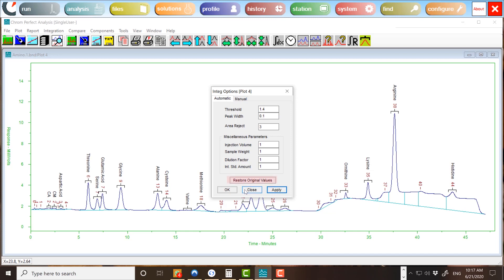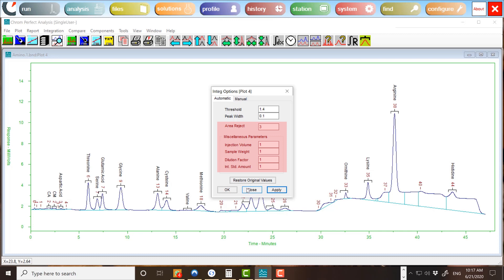Pressing the Restore Original Values button causes the original settings to appear in the form. Also displayed are several items that are not integration settings in the strict sense, but which affect reports. The Area Reject Threshold, Injection Volume, Sample Weight, Dilution Factor, and Internal Standard Amount are covered in more depth within the ChromePerfect Manual. Leaving these set to a value of 1 will mean that they have no effect on your results.